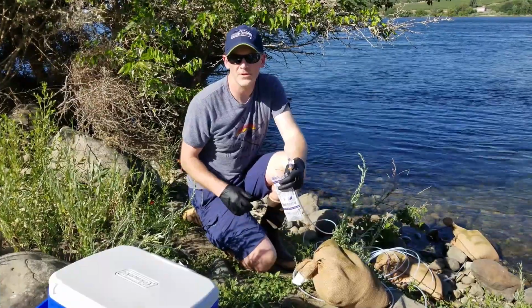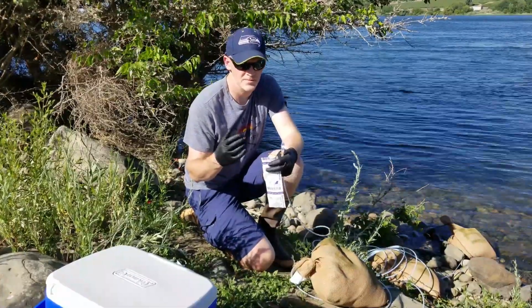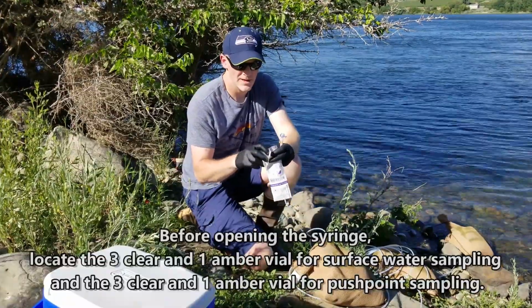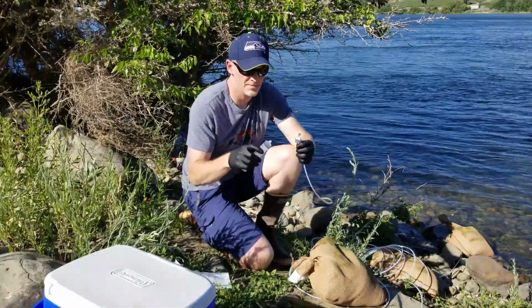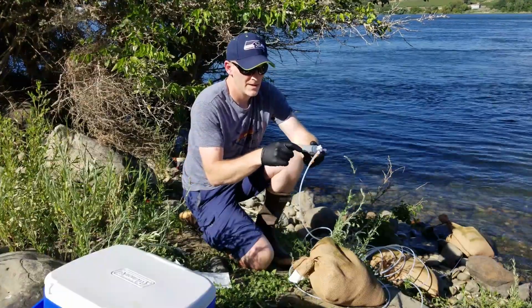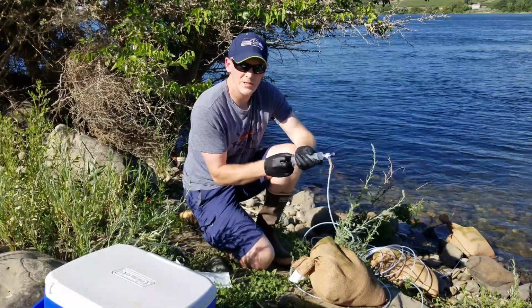When you're ready to sample, record the sampling time and your name on the hard copy data sheet, and put on a new pair of nitrile gloves to minimize contamination. Next thing you're going to do is get a new syringe and open that up. Take the syringe out without touching the outlet of the syringe. Attach it to the three-way valve. Just twists on. Now this is a three-way valve, so at this point you want the off pointing to this outlet here. We're going to sample the surface water first.